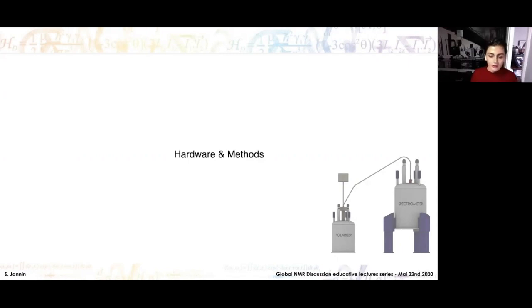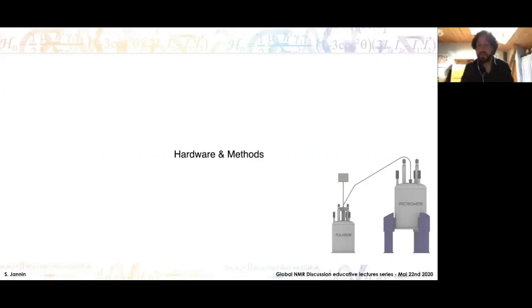So the next question is, why does the sample have to be dissolved inside the cryostat, inside the polarizer? Benno's bullet does not comply to that, right? Yeah, sorry if I said that it's wrong. It's one way to do it, but Benno has shown another way, and I'll come back to that at the end of the talk. So yeah, it doesn't comply, but it also works.